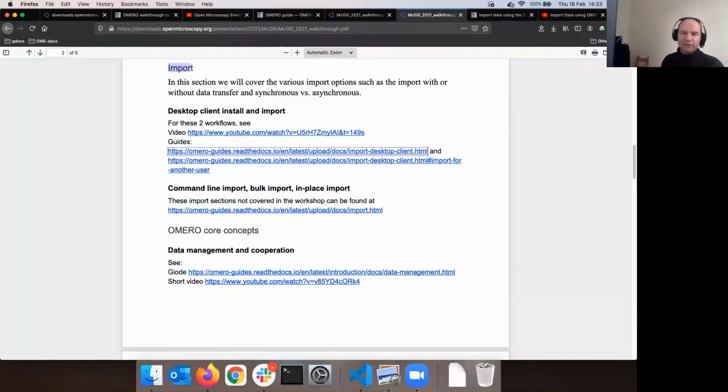I can see one, oh great, one thumbs up. That sounds fantastic. Who of you is on Mac as opposed to Windows? I suppose that, wow, so many hands up. Maybe that was the answer to the question who is on Mac. Yeah, so maybe I shot myself in the foot. We had a small glitch in the Mac. I hope that you got the second email. Sorry about that. This should be just fine, actually.